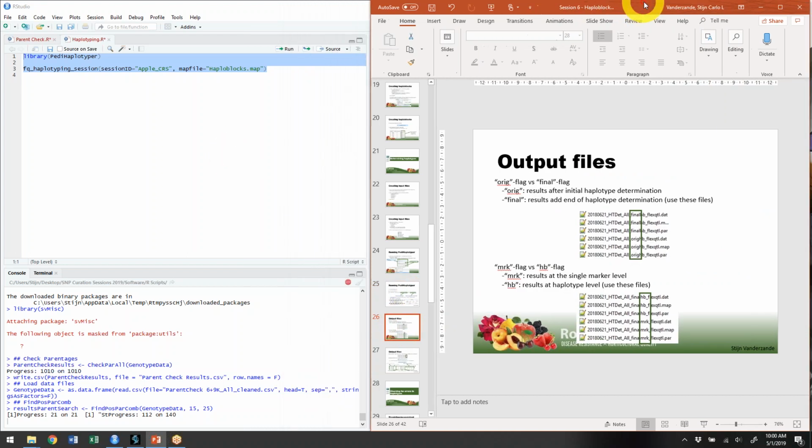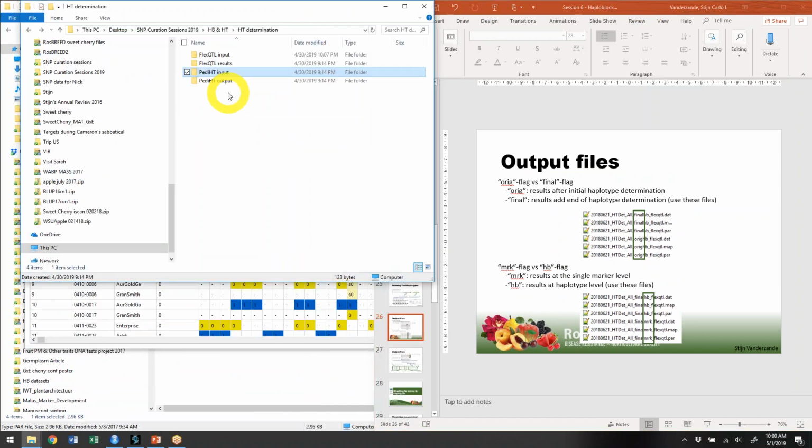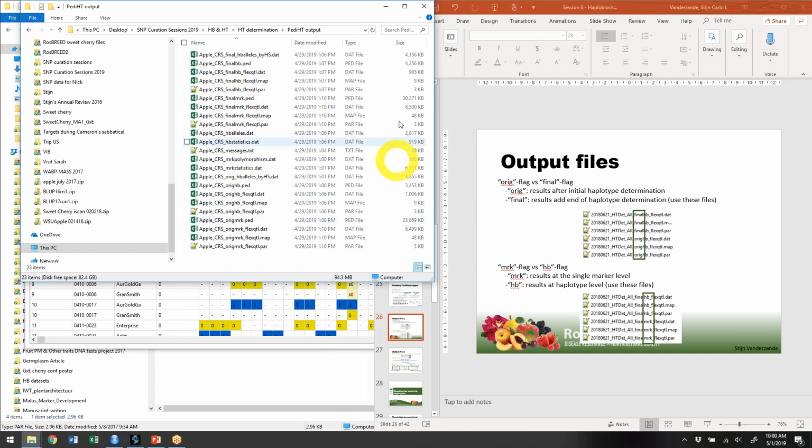So once we've run that, which is about, like you said, about 3 hours, I think, at least for the data set I've been working with, we get a whole bunch of output. And actually, there's a lot of this output I never use.